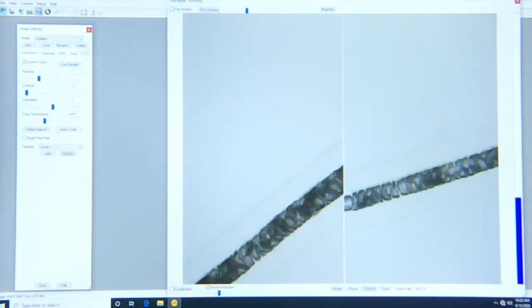And now when both of them are opened up, we can see that our images are now color and intensity balanced.